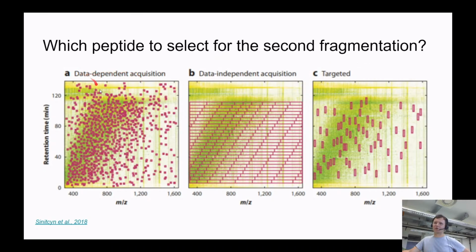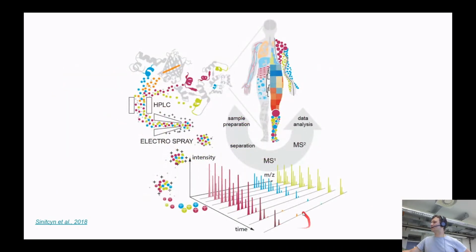Let's start with data-dependent acquisition. Imagine we see, like here, simultaneously 4 peptides, but in reality, let's say we see 200 peptides. We remember we spent the first 20 milliseconds measuring the first mass, but now we have 980 milliseconds to do what? Exactly what I said: select a peptide, fragment it, and measure it. Of course, it's very time-consuming, but we're going to do it not just for one peptide but, let's say, for 20 peptides. We have 980 milliseconds, and within this time range we can collect, fragment, and measure 20 peptides, repeating these three steps 20 times. And that's exactly what's happening.